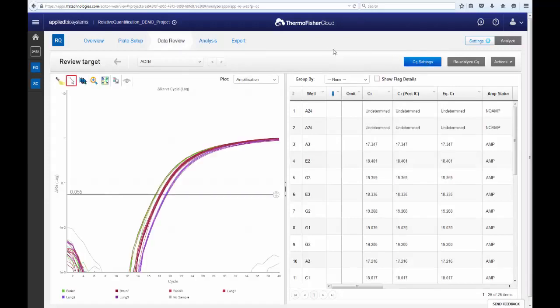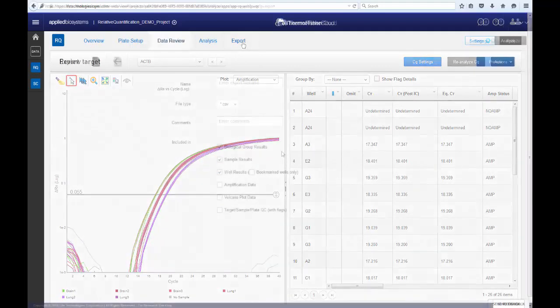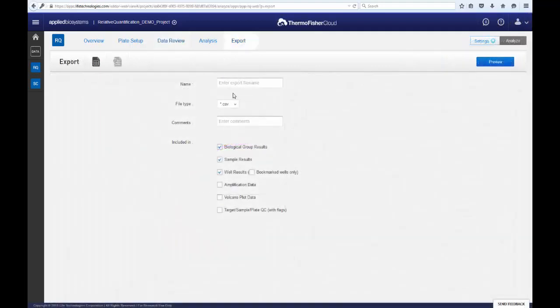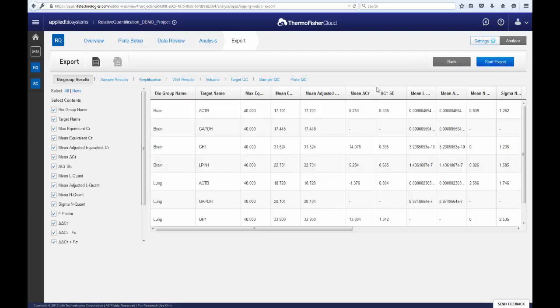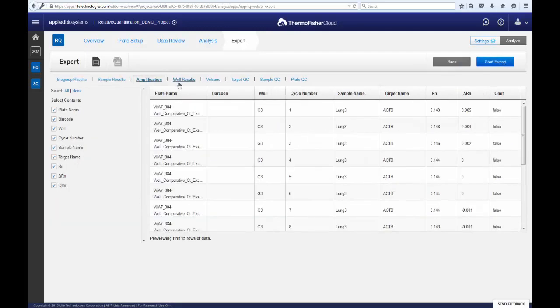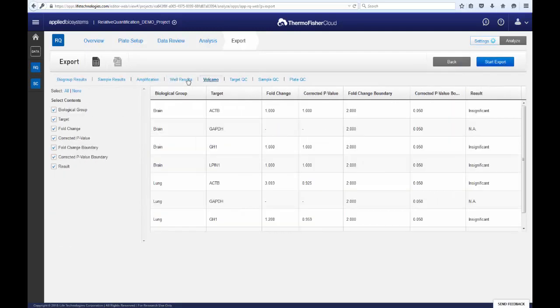When you are ready to export your data, click on the Export tab at the top. Here is where you can select which of the results you want to export, preview them, make specific column selections, and then export as a .CSV or .TXT.